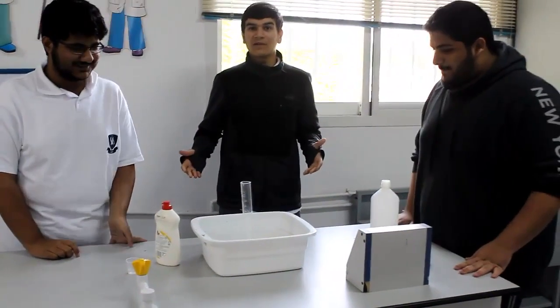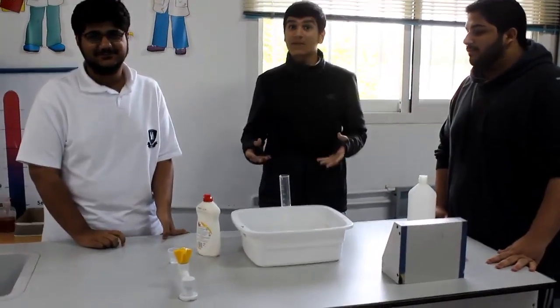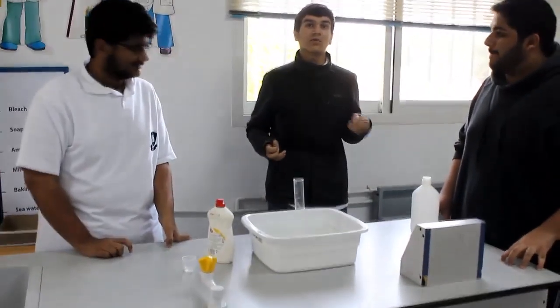Welcome to our chemistry experiment. In this experiment, we will be testing the effect of a catalyst on our chemical reaction. This is hydrogen peroxide. We will be doing the experiment which is called elephant's toothpaste.